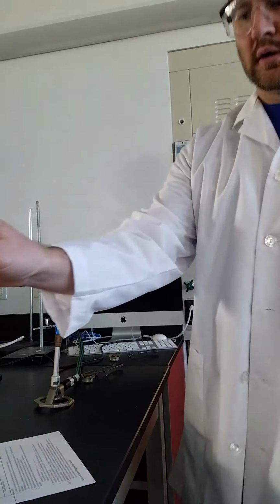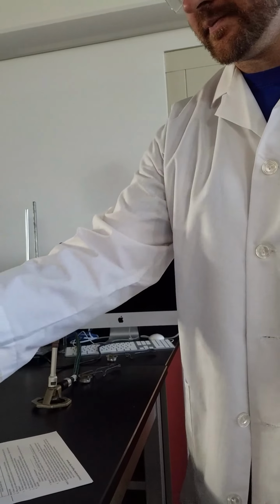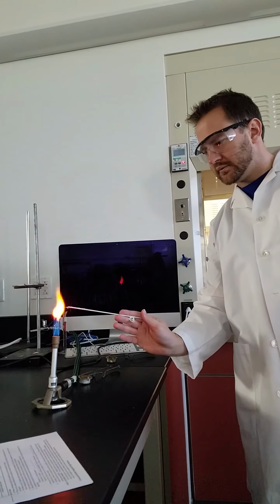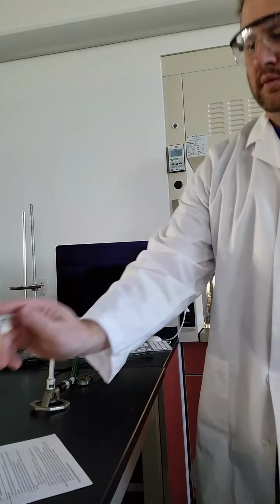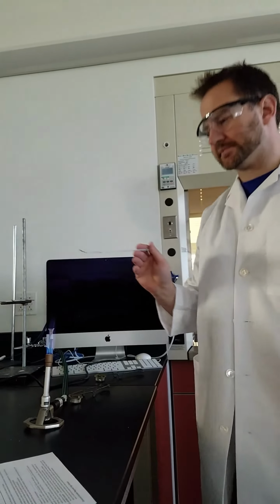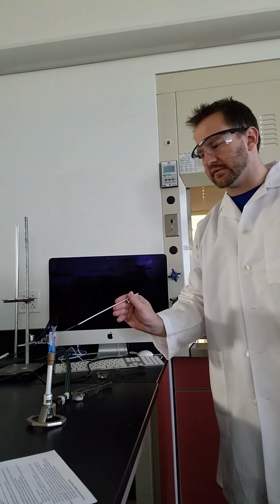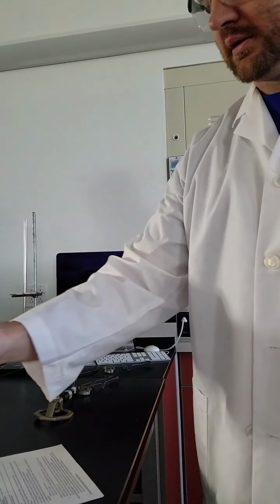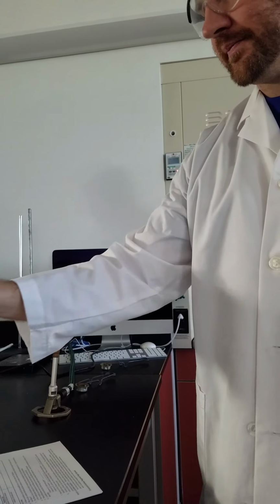Now we're going to look at strontium. This nice warped loop applicator. Now we'll look at calcium. And again, these are all nitrates. There you go. All right. Now we're going to look at barium.